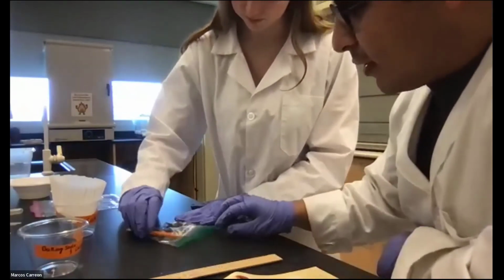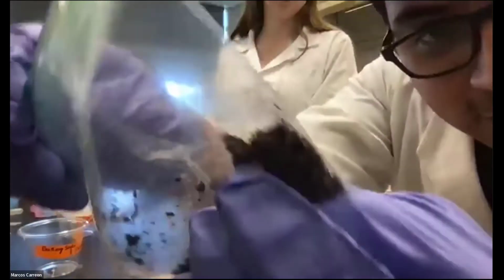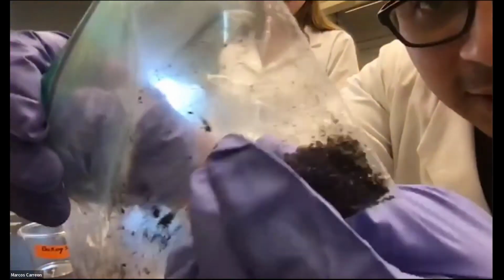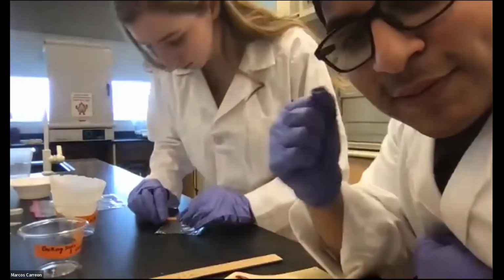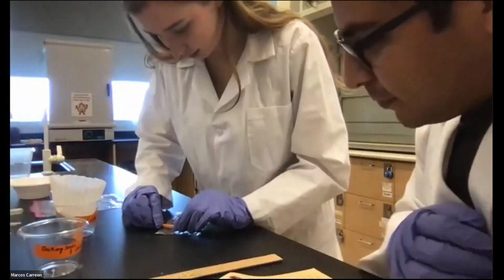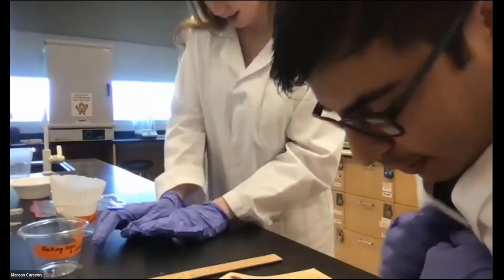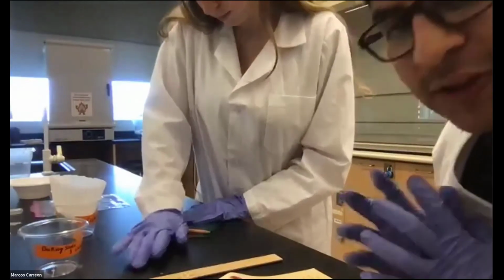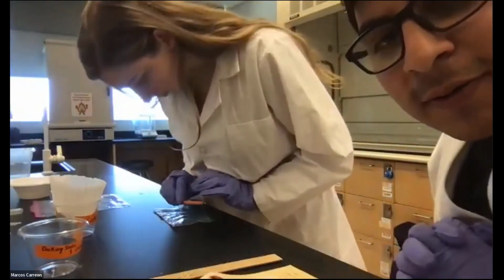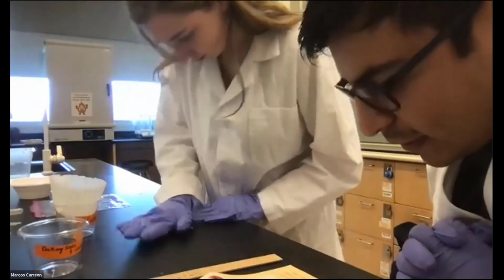So let's show the class. Right now, as you can see, they're kind of this big solid size, and they're getting ground up. It'd be awesome if we had a mortar and pestle. It's a little hard to see those. Once she gets some ground up into a fine powder, we can go ahead and move to the next step.